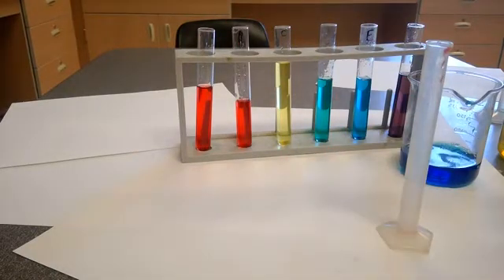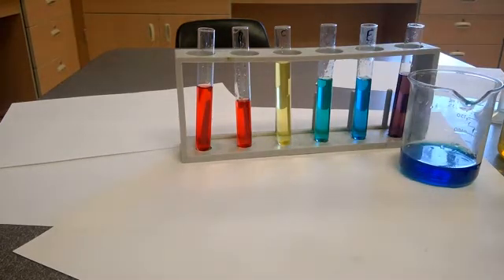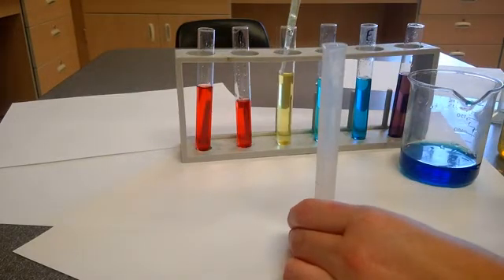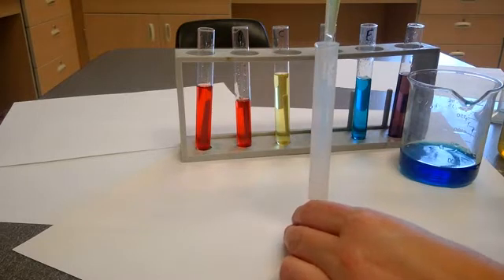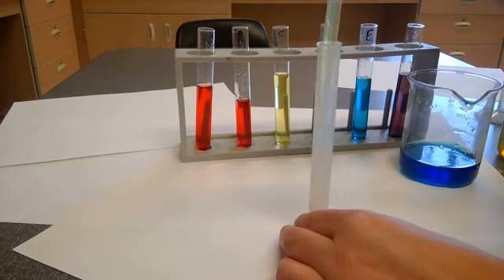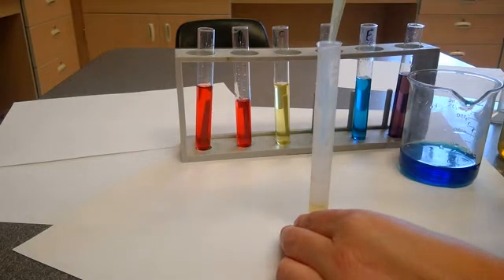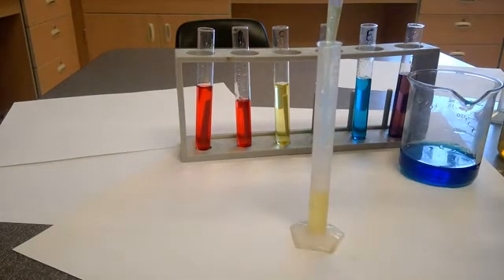Excellent. And my next step says that I have to take from test tube C right here, and I'm going to take 3 milliliters from there, and I'm going to add it into test tube B. Again, this is my best measuring tool for this, so I'm going to go ahead and take out of there. And again, what was that number? 3 milliliters. So there's the 2 and 1 more. Checking in on that meniscus line, and then of course put my extra back.